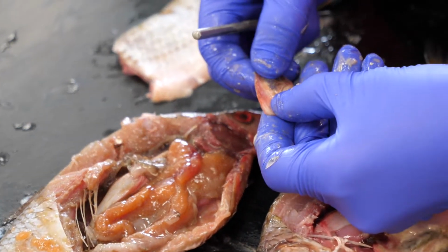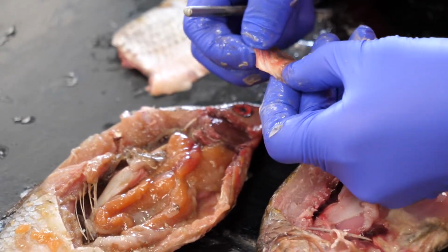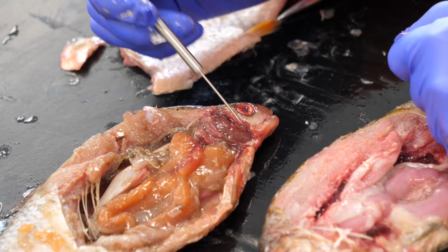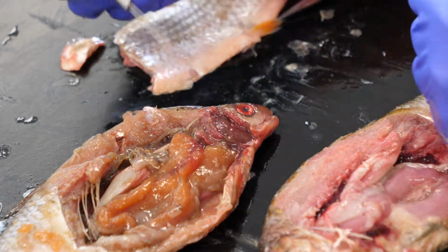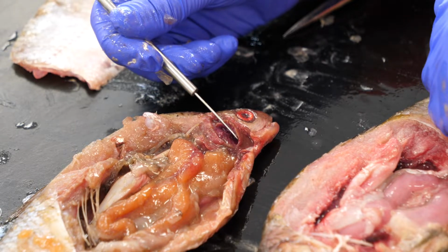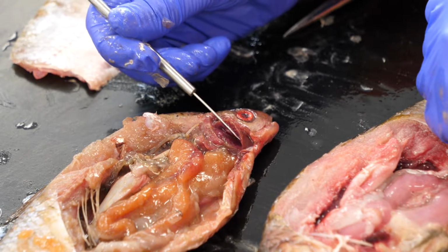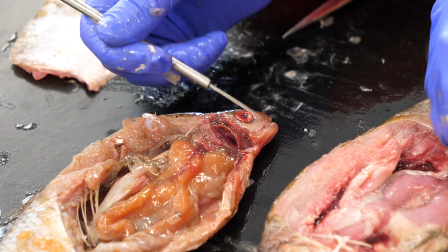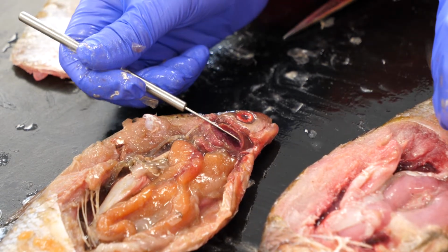This is a bony skin flap that I've taken off. And underneath we've got gill arches sitting one on top of the other. So we've got 4 of these. I'm just going to lift these up so you can see. Unlike the shark, where they were separated like this and exposed to the outside, the operculum covers all of these.